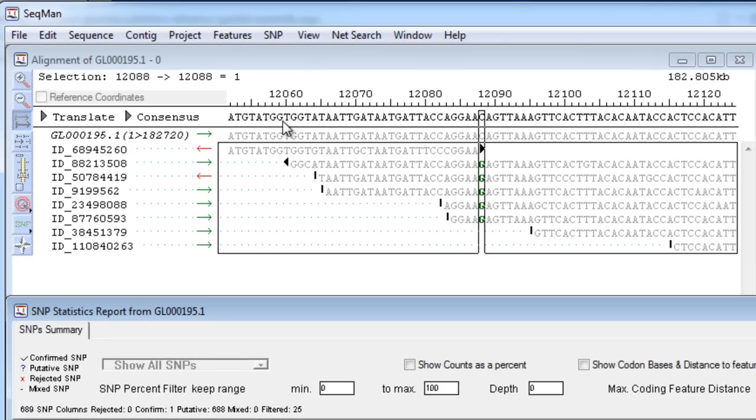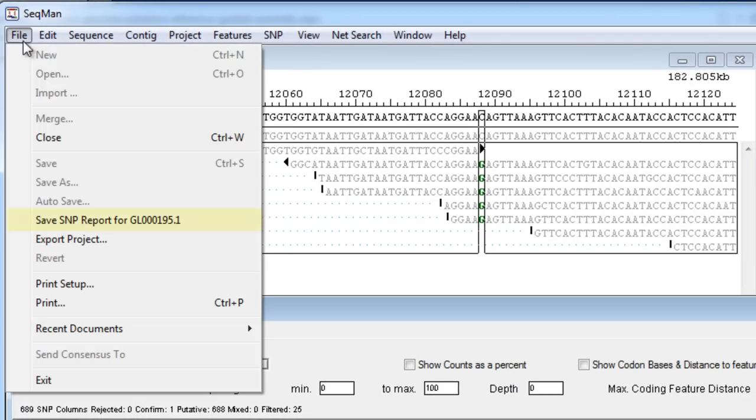If you wish, export the data from the SNP report as a tab-delimited text file for further review.